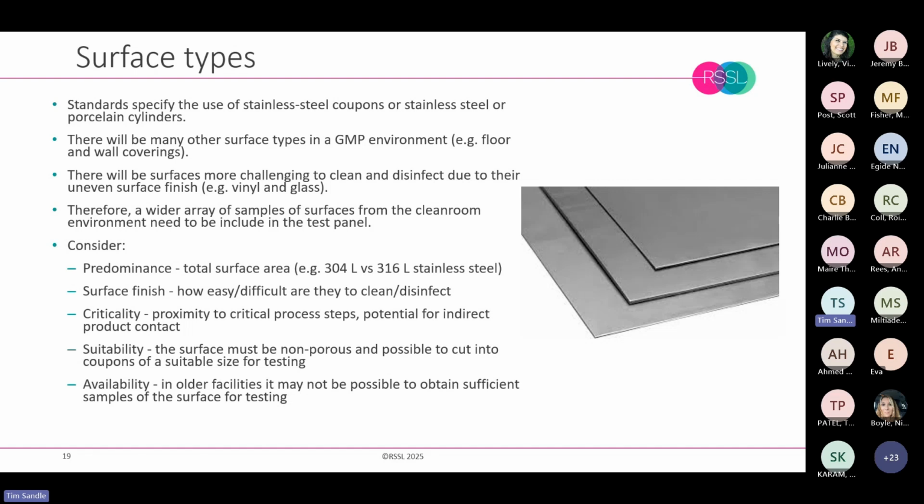And it's a common regulatory finding, one, if a facility hasn't carried out surface disinfection, but also two, if the surfaces are not representative, or there's no evidence of a rationale that says, I've picked surfaces of particular types. This is important because different microorganisms have different levels of attachment, so there are different physicochemical forces at play, and different levels of resistance, and also different levels of absorbency and cleanability, and so on. Plus there are things like surface finishes that can affect the ease or otherwise of disinfection. So there are factors to weigh up, but equally it's important to take a nuanced approach.